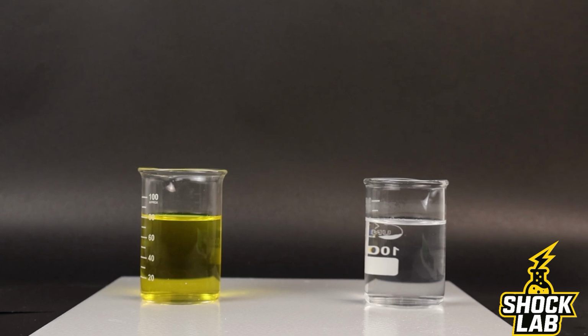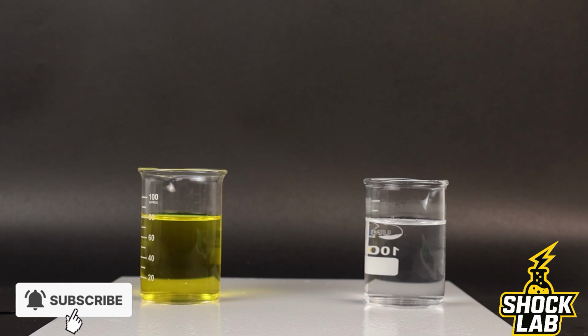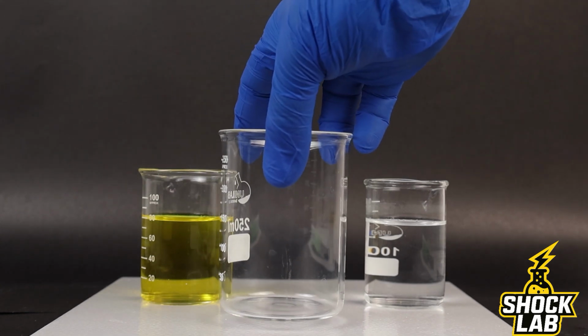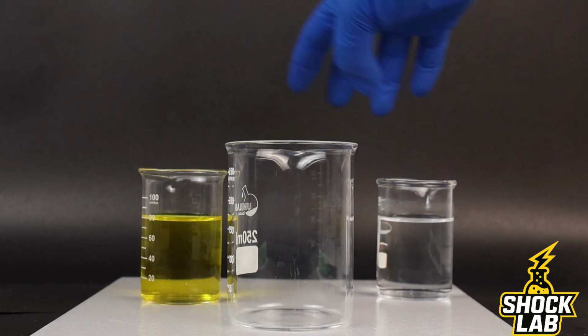On the left, we have potassium chromate, a yellow chemical compound that contains chromate ions. On the right, we have barium chloride, a colorless compound commonly used in chemistry laboratories. Let's mix them together and observe the reaction.